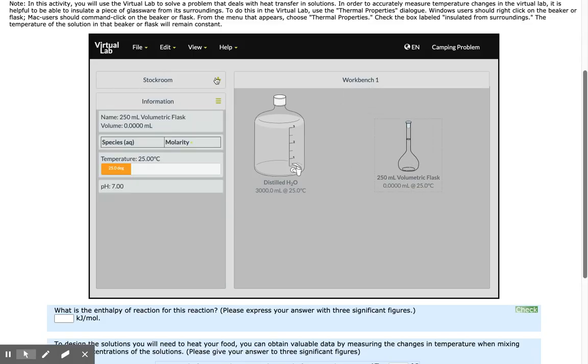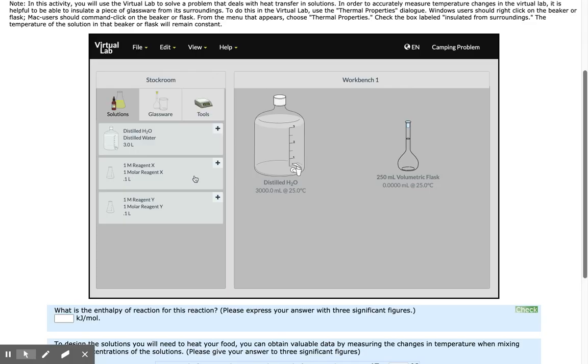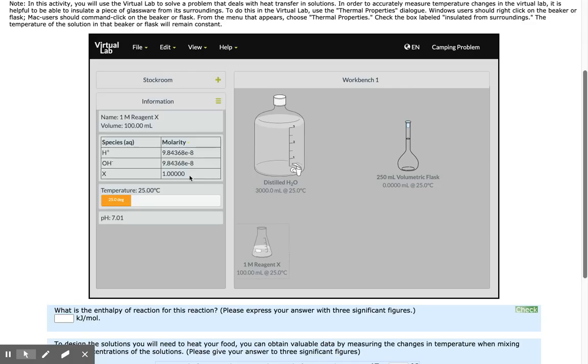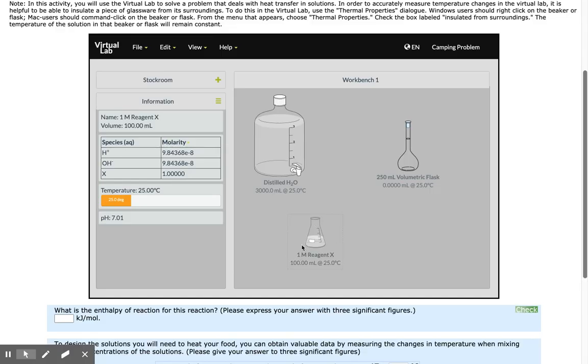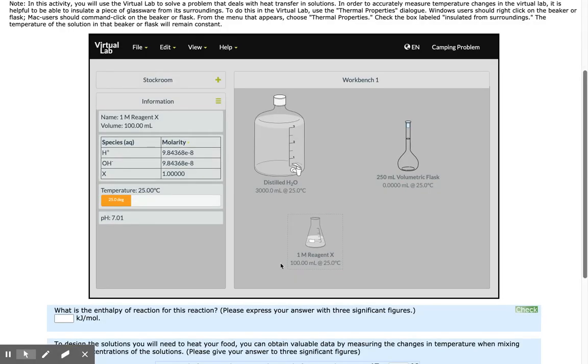I also need my solution of Reagent X, which has a stock concentration of 1 molar. I have 100 milliliters of that here.